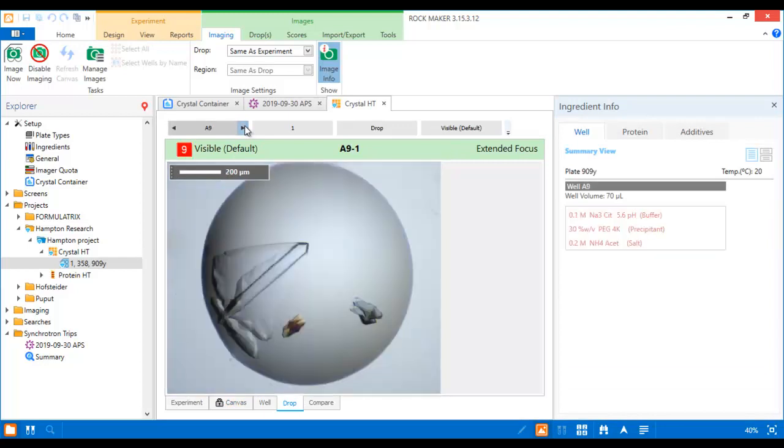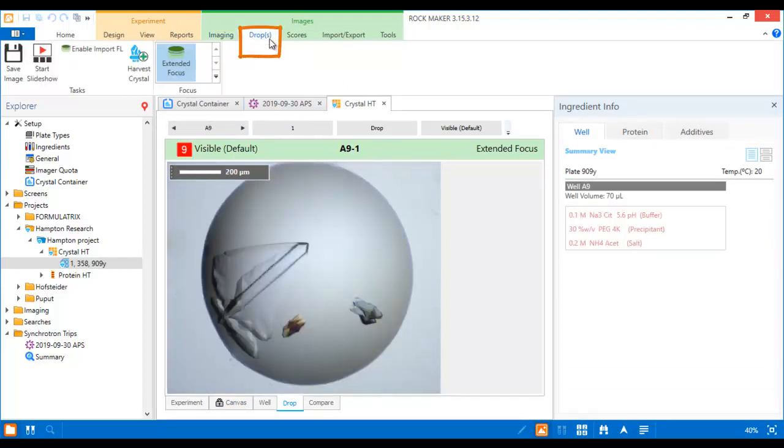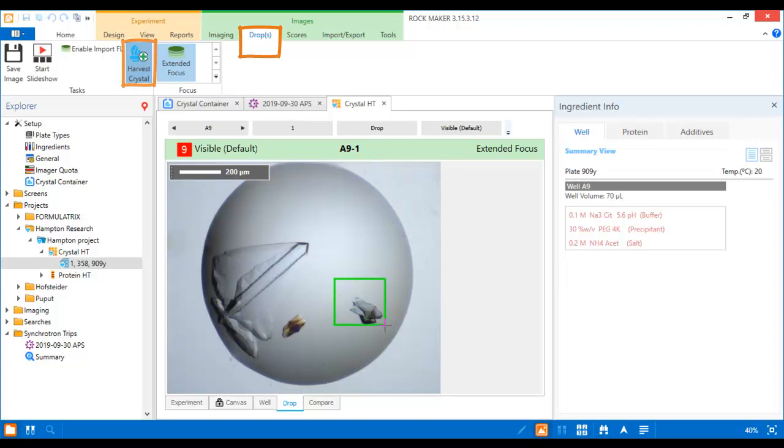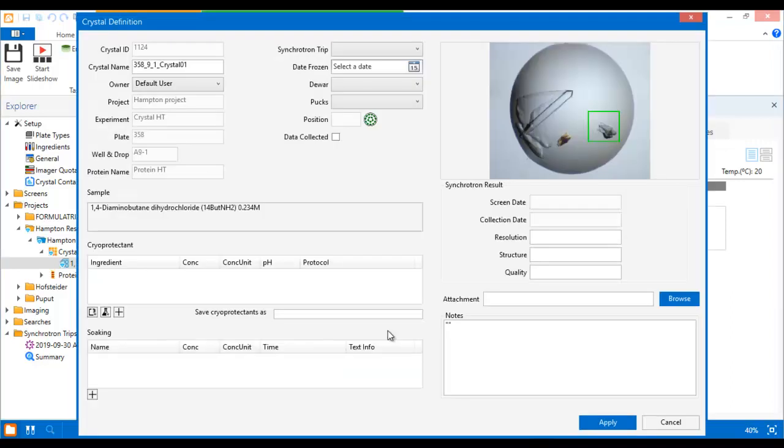And here is our first crystal. To harvest this crystal, go to the Images tab set and click the Harvest Crystal button. Draw a box around the crystal and the crystal definition window will appear.